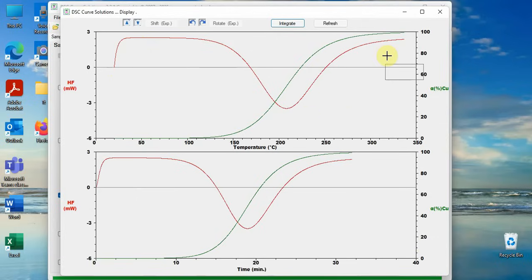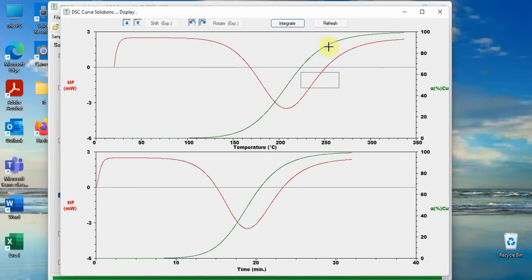The green curve is for degree of curing. It starts from zero, increases during curing process until fully cured.